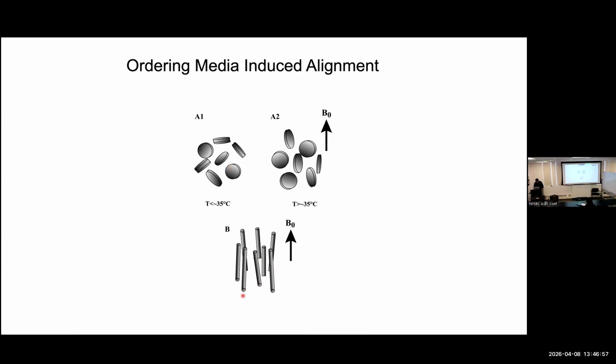You can also, for nucleic acid applications, use phage, which are basically genomes of phage with DNA coated with proteins, and these long rods will align parallel to the magnetic field because of the way the DNA goes around. And so the rod aligns parallel to the magnetic field. So now I am able to achieve this medium that is itself aligned.